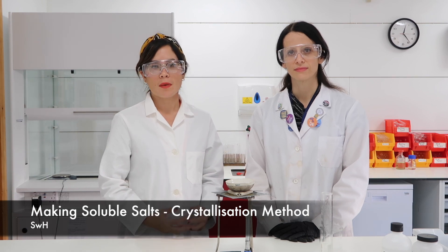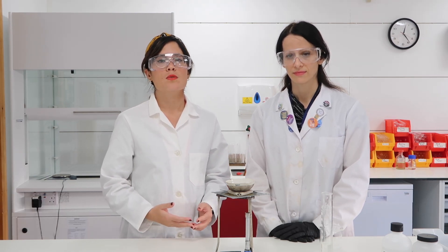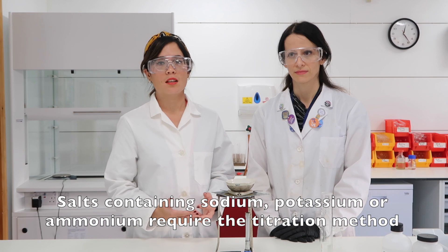You should absolutely follow that! In today's video, Emilia and I are going to be showing you the method used to make soluble salts. Notice that these are salts which do not contain sodium, potassium or ammonium — remember you need to use the titration method to make those sorts of salts.